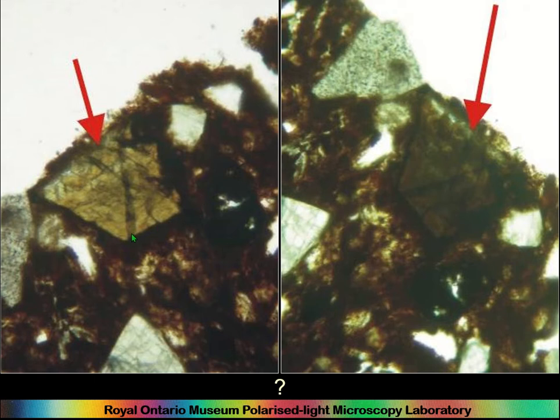Another thing you might notice is it has these cracks which are quite straight and parallel, and see, these ones actually are parallel to this one. And also there's another one, it actually shows up here as well, which is at about 180 degrees from these ones, which would suggest this has two cleavages, not 180 degrees, 120 degrees, at 120 degrees. So that should give you a very good idea of which mineral you're looking at here. It's an amphibole, possibly hornblende.